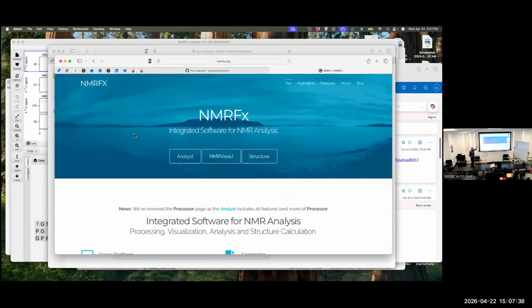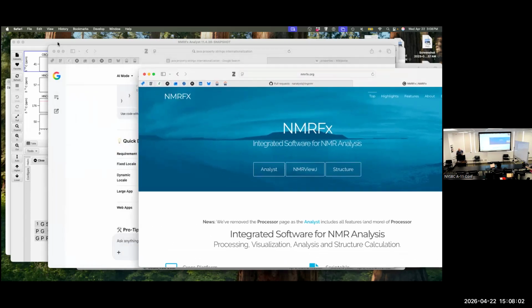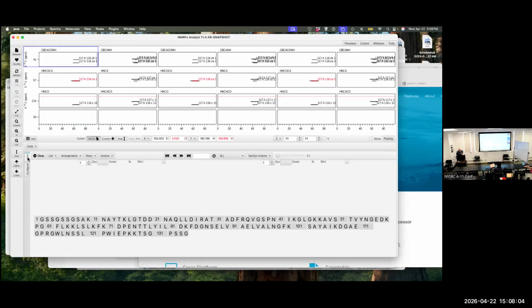I like the water and oceans, so I call this tool Runabout, with the idea that I think of NMR spectra as being oceans of noise, and scattered in the noise are islands of signal. Runabout gives me an efficient way to zip around through the islands and find things without having to wade through acres or kilometers of noise.